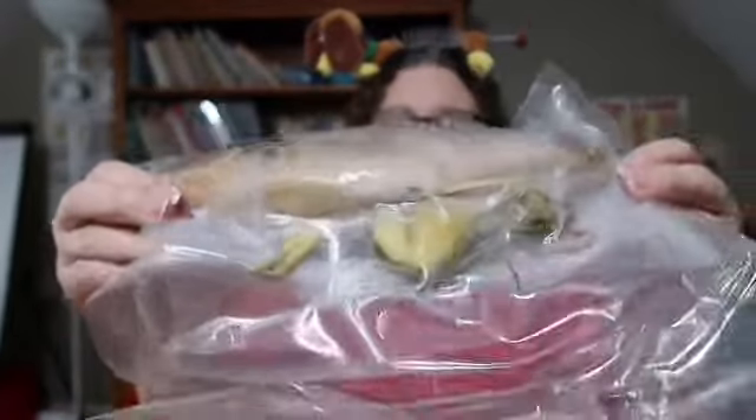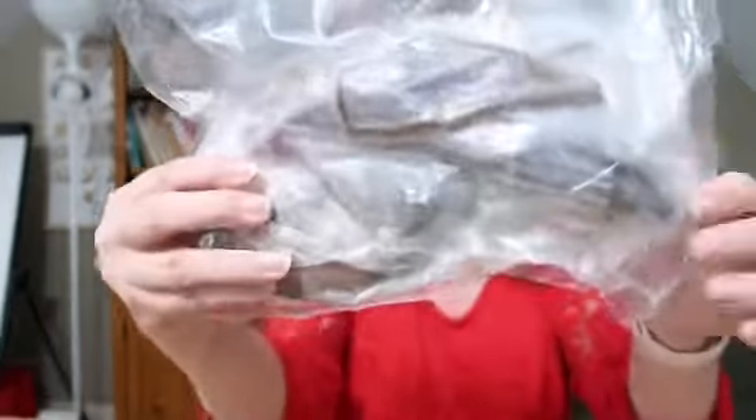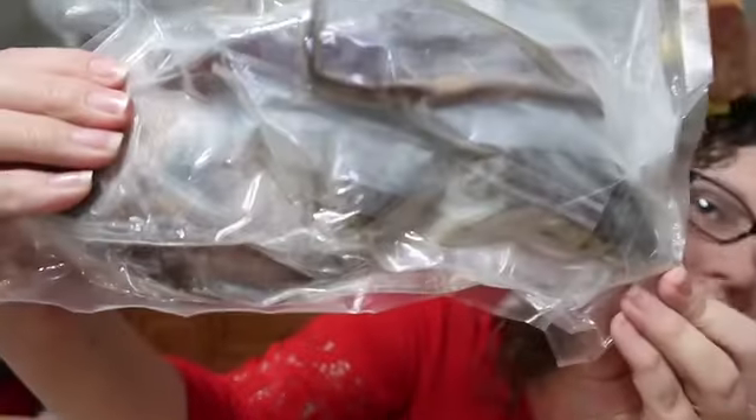Here is a package that is vacuum-sealed with the specimens in it. That's a perch fish, I believe. There is an earthworm — you probably can't see it very well on camera — but there's actually a frog, an earthworm, a perch fish, and a crayfish in this kit, all vacuum-sealed together. Since we've already finished the curriculum, we'll probably only do a couple of the dissections. We'll definitely do the frog dissection first, and my husband will pick which others to do.